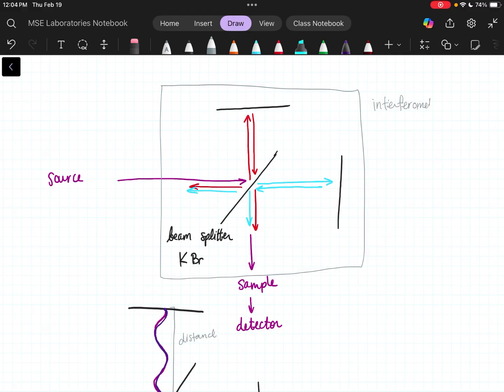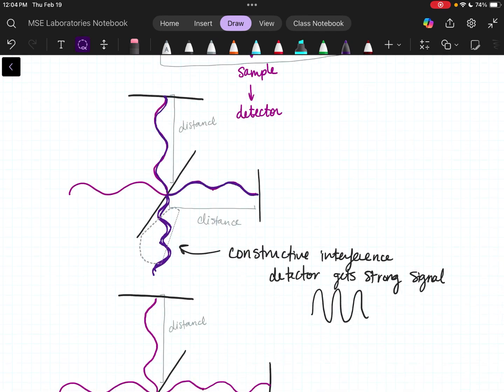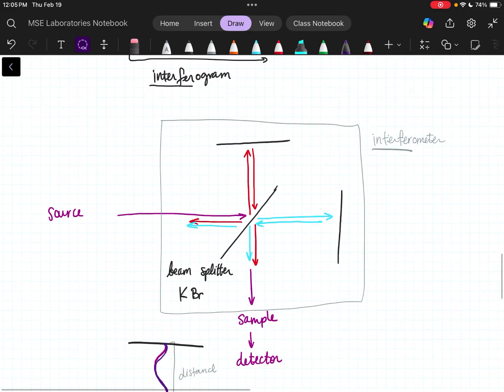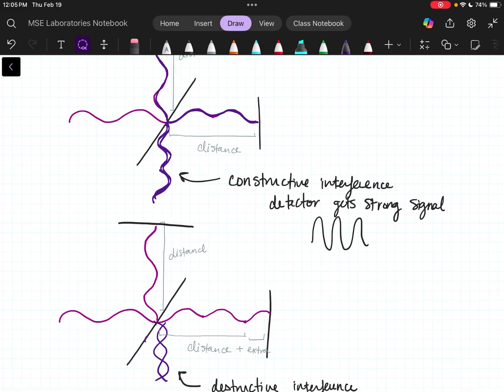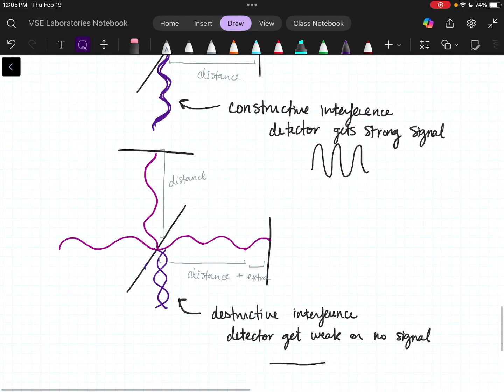We call this thing the interferometer. What we're doing is we're creating interference. That's this guy or this guy. This mirror has the ability, it's on a little motor. It moves back and forth. This mirror is stationary.